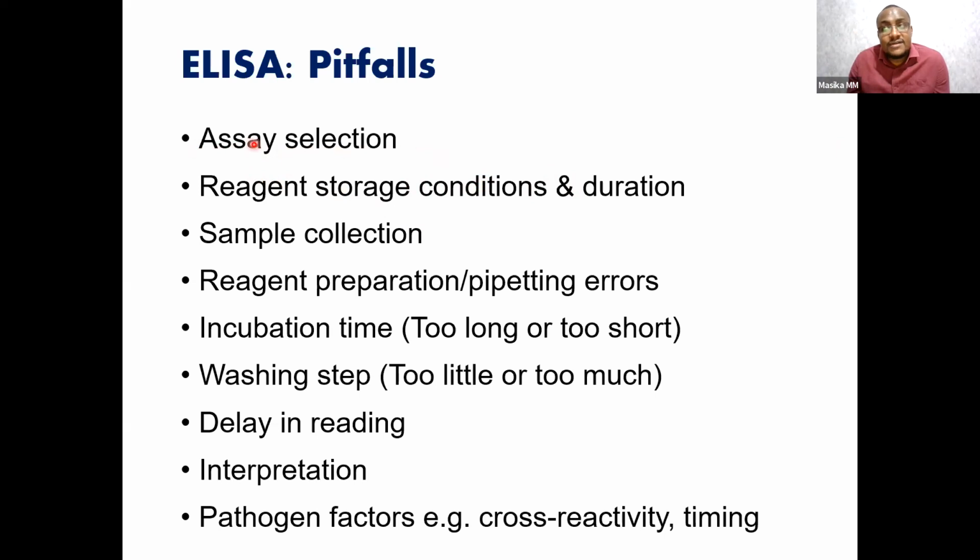But sometimes when you find you have very little sample, you can top up with PBS, which is basically something we call phosphate buffered saline. It's basically safe water for biological processes.